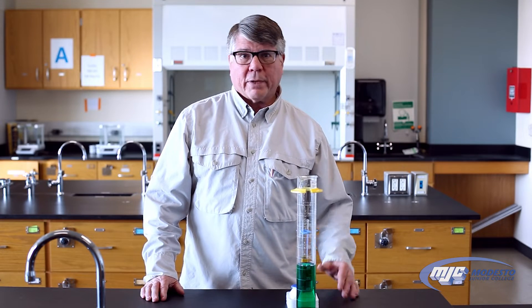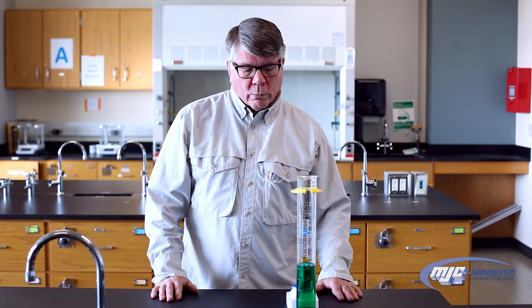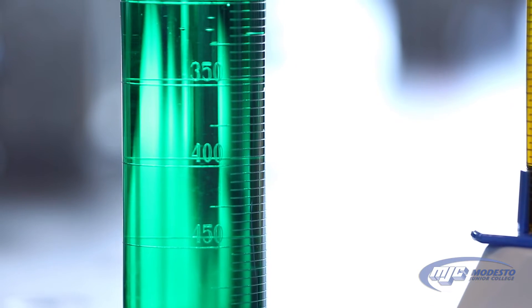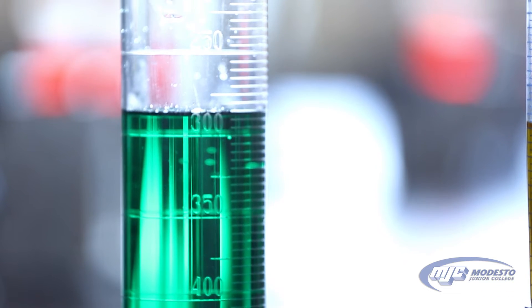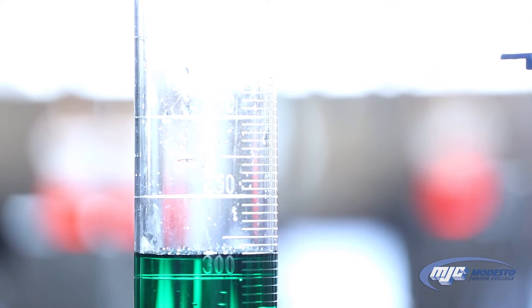Hey guys, this is an explanation of how to measure a volume with a graduated cylinder. One of the first things you need to be aware of when you start to use a graduated cylinder is how far apart the closest marks are to each other, because that determines to what place you will record any volume that you measure with that graduated cylinder.